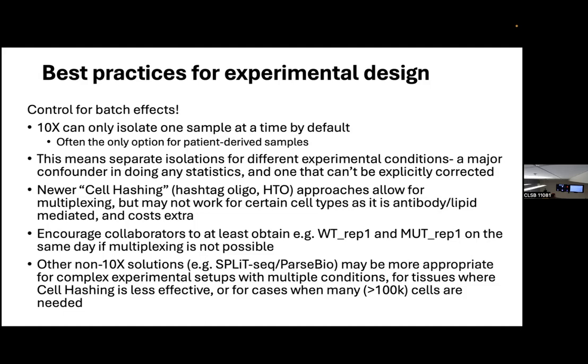But philosophically or theoretically speaking, if you just ran the same sample through 2 inlets, is that a technical replicate? If you ask 10 people, you might get 10 different answers on that. So it's not super clear, but it can be valuable to increase your cell count per individual sample. That would, in a way, be a technical replicate, but in effect you would just combine them and not really treat them as replicates. Okay, yeah.